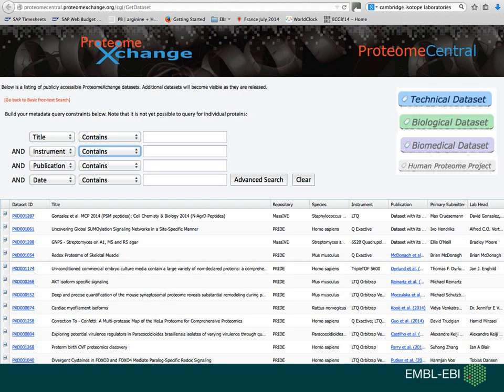And then the tags also allow us to group larger groups of projects, often called, let's say, the International Human Proteome Project, and group the output from multiple PIs into a larger context. This is not yet directly accessible in ProteomeXchange, but will be soon. It's already accessible on the PRIDE site in the PRIDE archive.